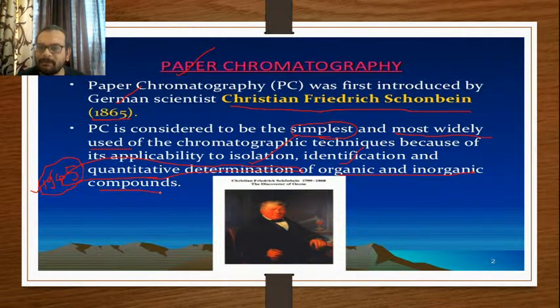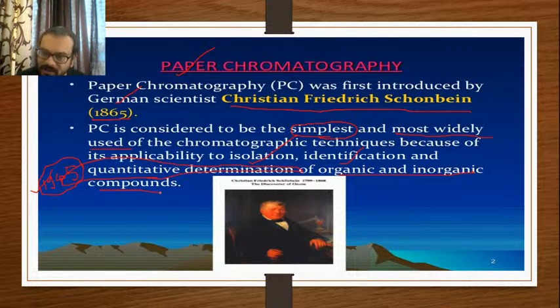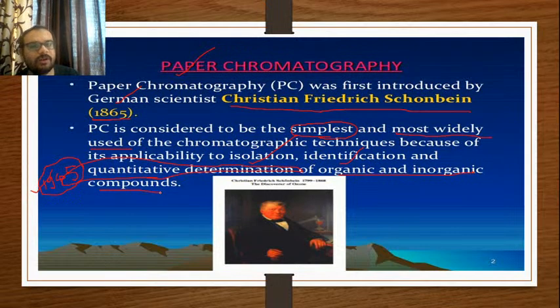It is applied in isolation and in identification of unknown compounds. Determining the concentration or quantity of a substance dissolved in the mobile phase can easily be done using the paper chromatography technique.